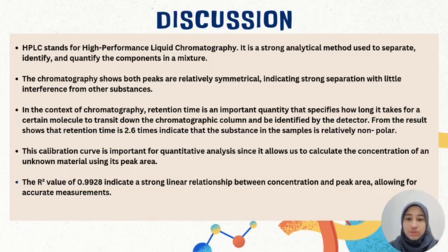In the context of chromatography, retention time is an important quantity that specifies how long it takes for a certain molecule to transit down the chromatography column and be identified by the detector. From the result, it showed that the retention time is 2.6 minutes, indicating that the substance in the sample is relatively nonpolar. This is because nonpolar molecules interact less with the polar stationary phase and elute more quickly.